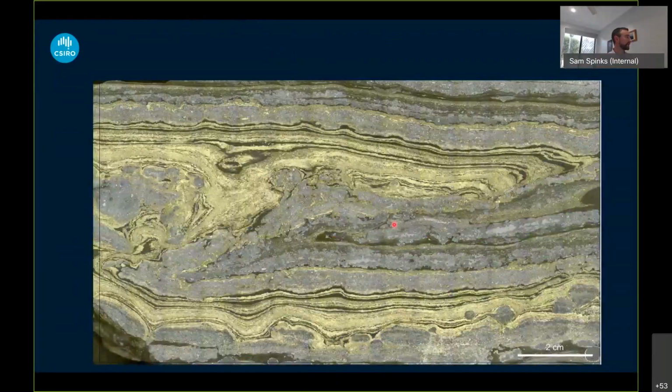Look at another example of this facies where we can look at some trace element evidence for this type of mineral system. This is from the same section of the deposit, just a different ore lens. And what we see here is a laminated pyrite carbonaceous silt bed, which is being folded over, so a full slump feature, where we have laminated pyrite that's draping over nodular carbonate lenses, which are sometimes continuous, sometimes not.